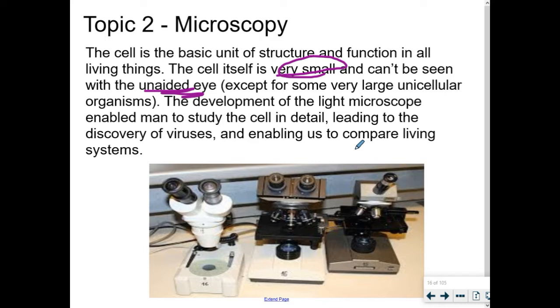As another example here, humans have the ability to distinguish things basically as small as hair. Anything smaller than hair, you can't actually see the differences between it. Right now, so I'm just going to use you as an example, I can see individual hairs on your head, but only because I'm like 1.5 feet away from you. Right? I can't see the individual hairs on your head way back there. I know they exist, right? But I can't actually see them. That's resolution, the ability to see things, and this is really the key words right here, in detail.